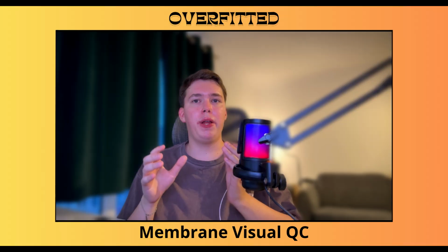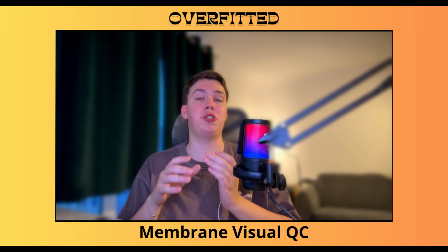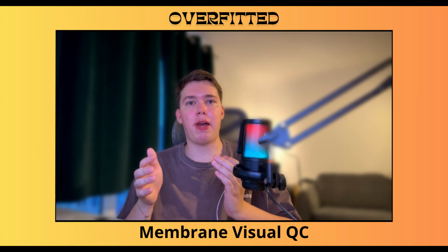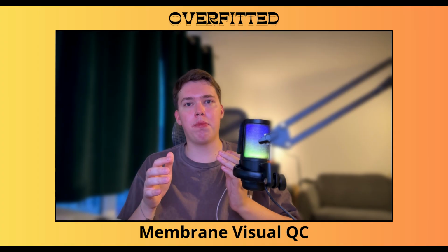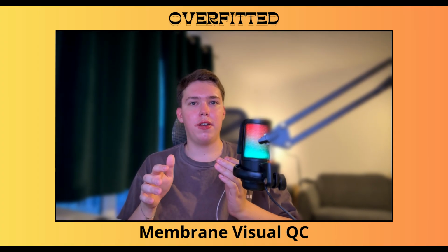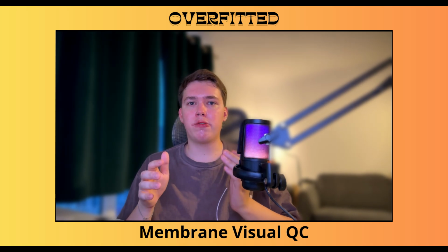At this point, I realized the project was becoming something slightly different from what I originally imagined. It wasn't just about making one structure easier to inspect. If the workflow was going to be useful beyond a single example, I needed to think about repeatability, multiple structures, failure states, and provenance at scale. That's where batch review came from.